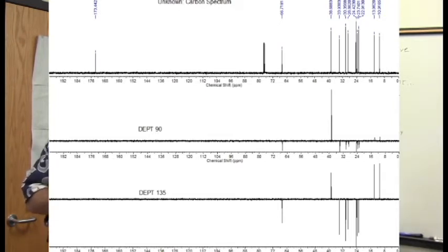Now it's on to the DEPT-135. Here we see the peak at 38 standing nice and tall like it was in the DEPT-90, but now it's joined by these two over here. Remember, these would have to be methyl groups. Methyl groups have the characteristic of not being in the DEPT-90 and pointing up in the DEPT-135. All of these peaks here are pointing down. We have seven of them and so we conclude that we must have seven CH2 groups in this molecule.